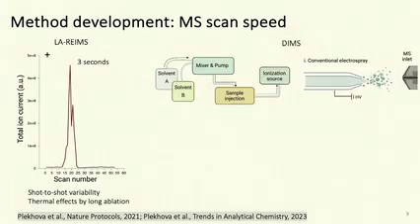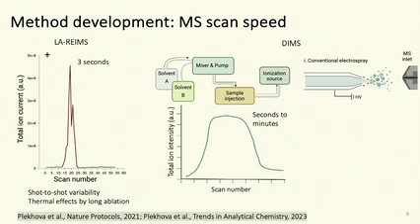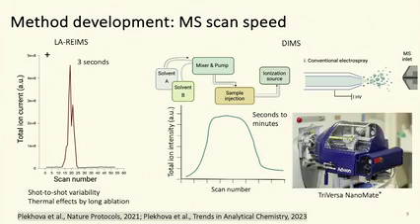However, if we talk about DIMS or direct infusion data, we can safely infuse and ionize using electrospray samples over a prolonged time, especially if we deal with modern configurations such as nano direct infusion or chip-based ionization sources.